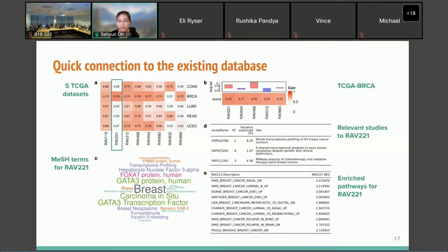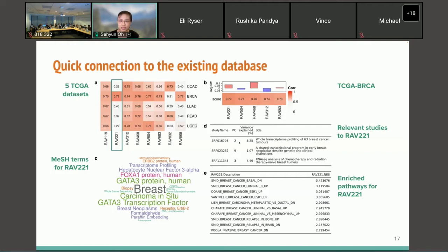I then ran validation on breast cancer again, shown in panel B. The top panel of panel B shows the average silhouette width of the RAV, which can be used as a guide to identify the right RAV for your dataset. From the validation process, RAV 221 appears to be the right RAV for breast cancer data. Once you identify the RAV of interest, you can instantly print associated MeSH terms in a word cloud shown in panel C, relevant studies in panel D, and enriched pathways in panel E.